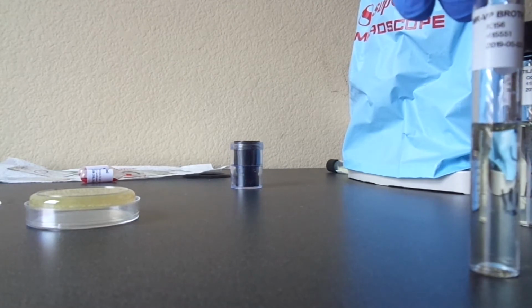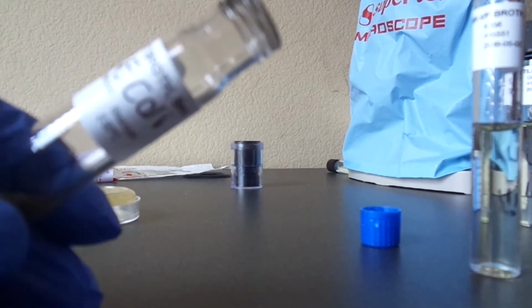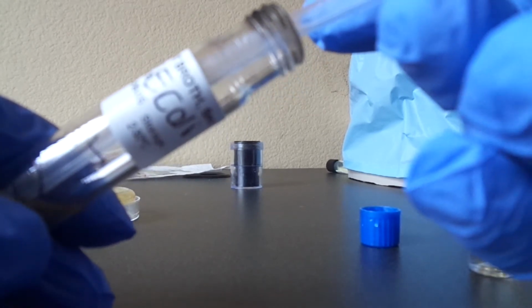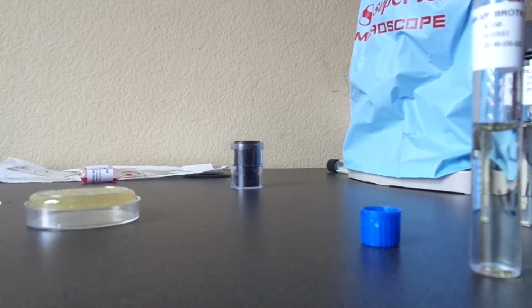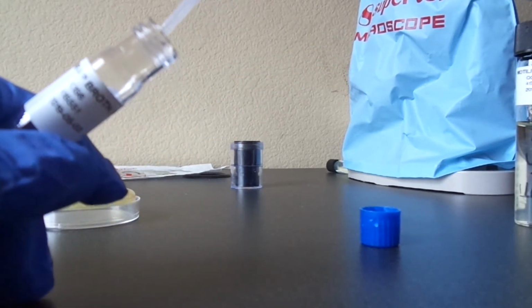Take the cap off of this. And then here I'm just going to need about 4 drops of the cultured E. coli, and I'm going to put 4 drops inside.